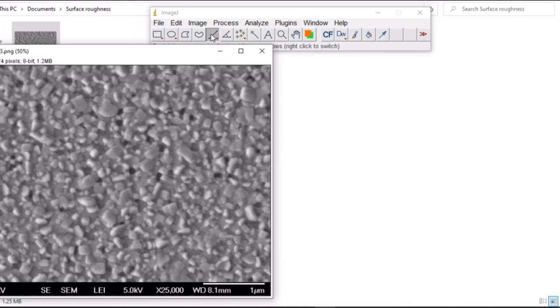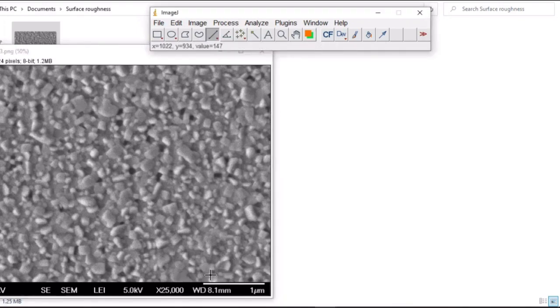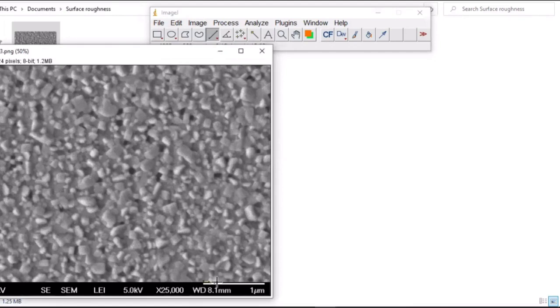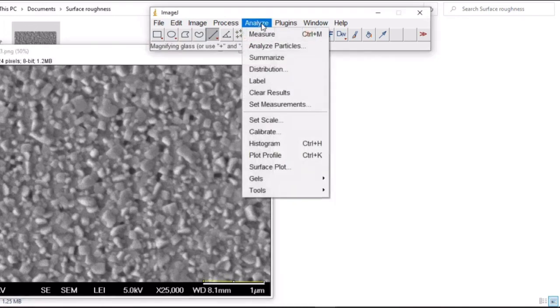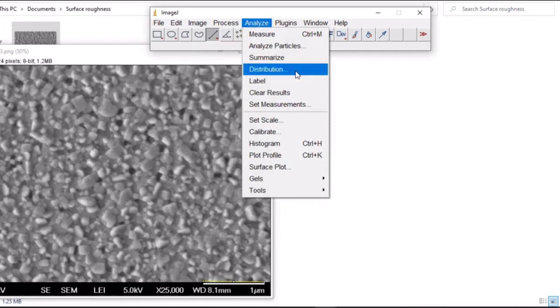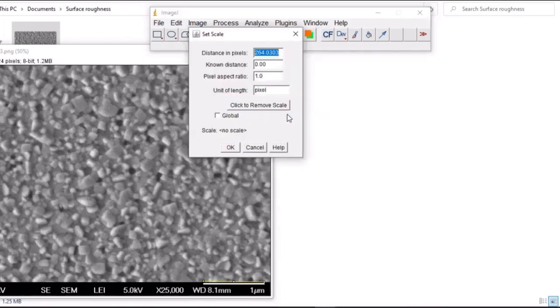So pick the freehand line, measure exactly what you have here, and then go to analyze. Notice here that it will change. Set the scale. This is automatically generated.